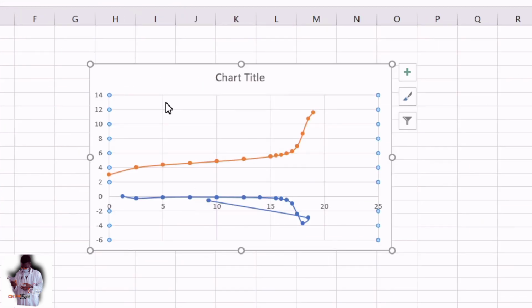Now for here, as you can see, you are confused. How are you going to identify the endpoints and other things here? Because we want to identify the endpoint, you have to make everything look clear and legible for us to see. And we have to make sure that they intersect. The intersection point is what is going to help us identify the endpoint of the graph.